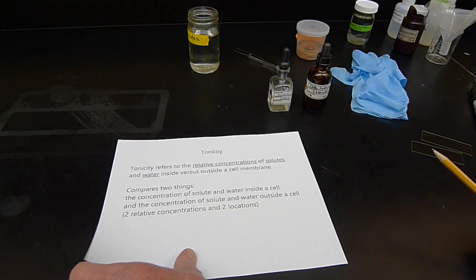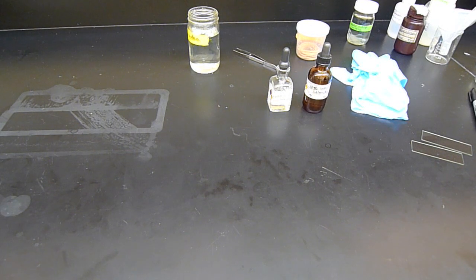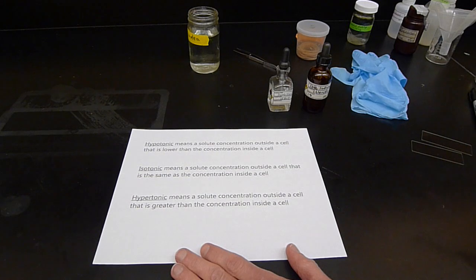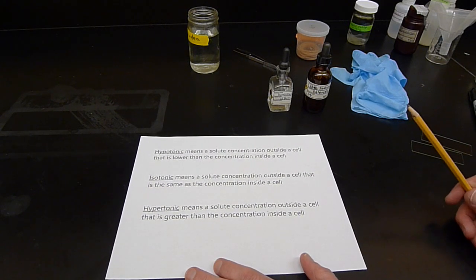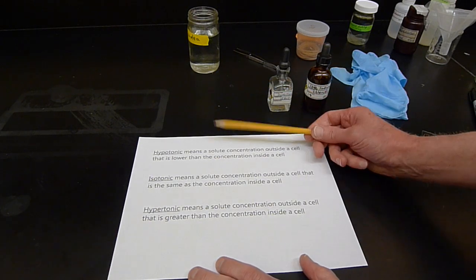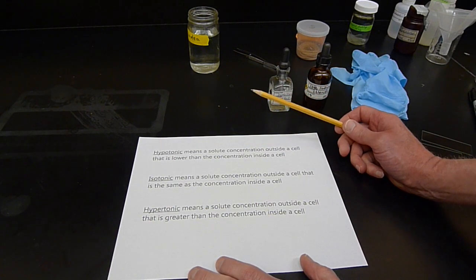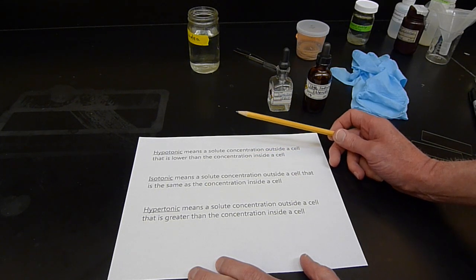In any case, what I'm going to do is expose these leaves again to either a high concentration of sodium chloride and then some distilled water. So there's three other pieces of terminology you need to remember here. Hypotonic means that the solute concentration outside a cell is lower than the concentration of that solute inside the cell.